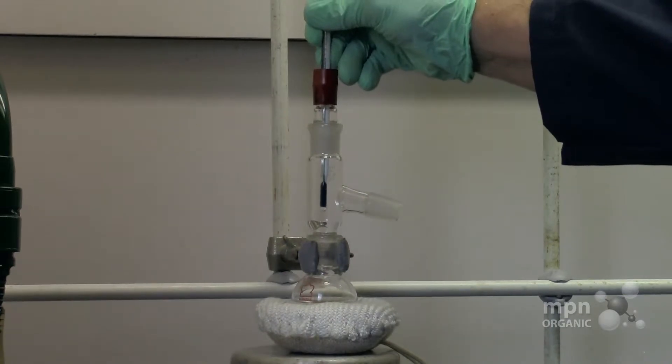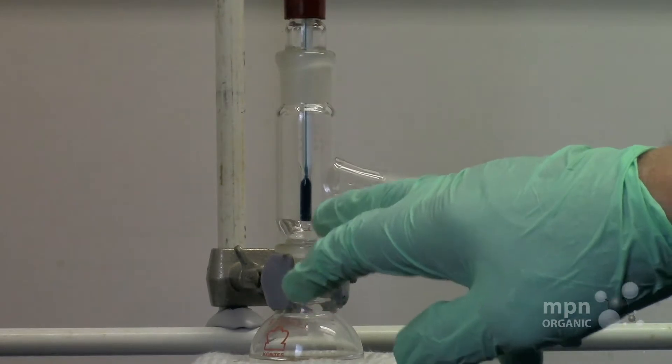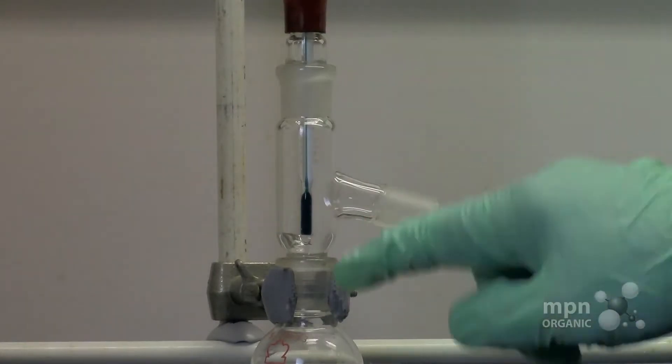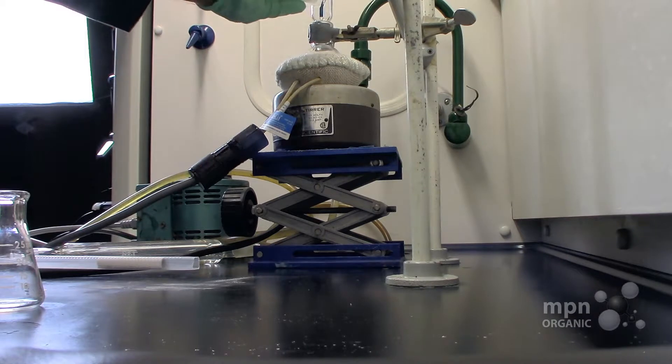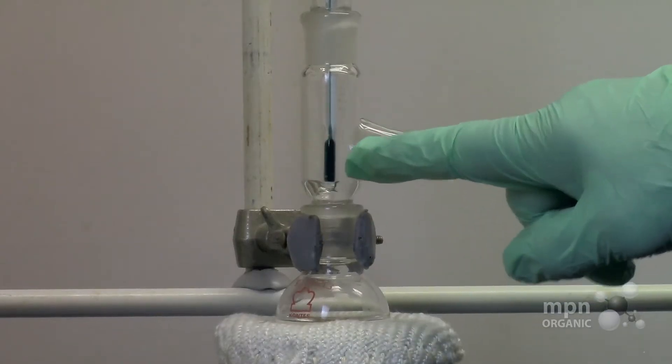This is going to go into the three-way connector. Now we want to make sure that the distillation thermometer is about this level down here. The reason is if it's too low it'll record too high a temperature, and if it is too high it will record too low a temperature. It should be right about in the middle where the side tube comes out of the main tube — where it splits the thermometer bulb in half. That's about right.